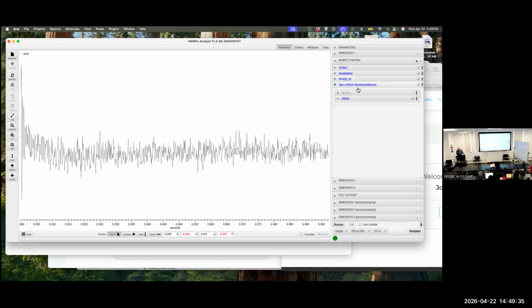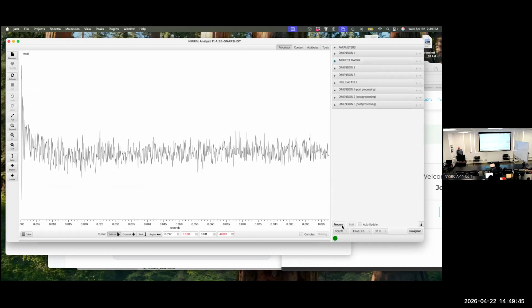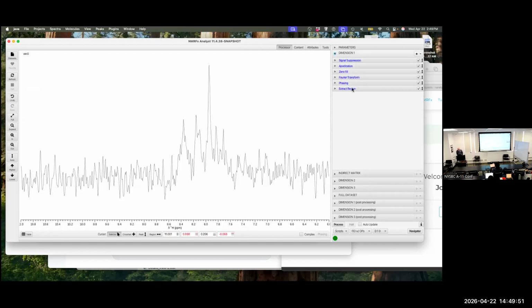And then for the processing method we have NESTA, GRINS, or IST. I'll just click process. But go to dimension 1.